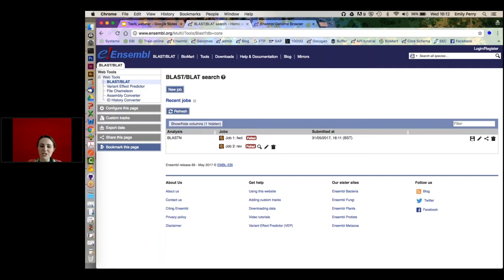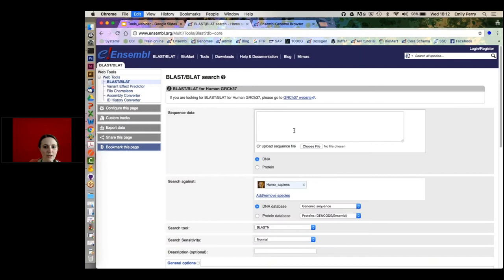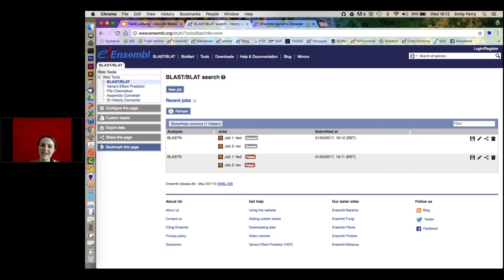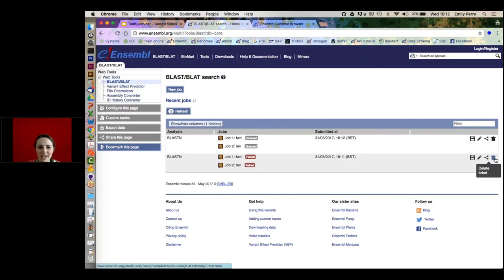They've failed — I'm a little concerned that I may have some problems with the tools today because of the update. I'm going to hit New Job, paste the data in again, and hit Run. This is a slight concern: the release wasn't planned for today but it got delayed until today, so there's a danger that my tool jobs are not going to work.